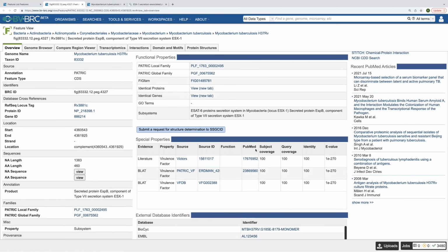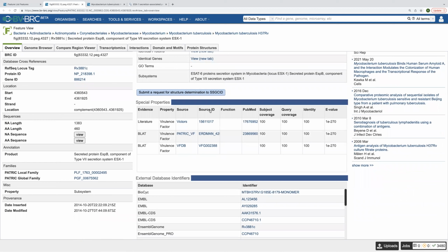And it's also showing any genome that is annotated in the resource is blasted against specialty gene databases for virulence factors, antimicrobial resistance genes, essential genes, drug targets, transporters, and human homologs.